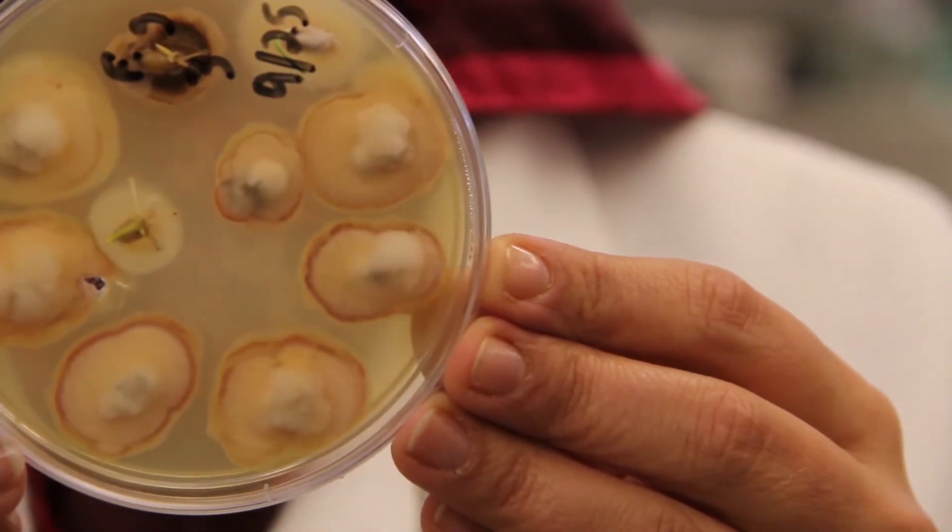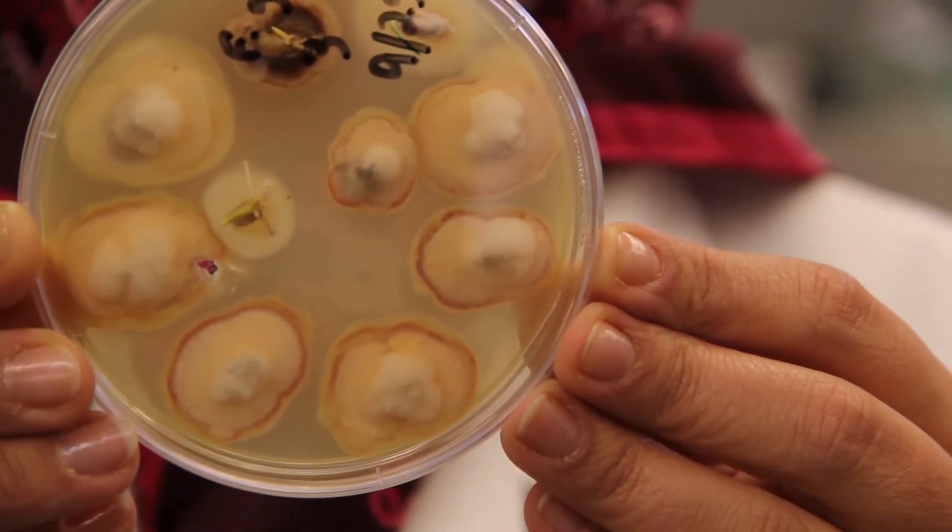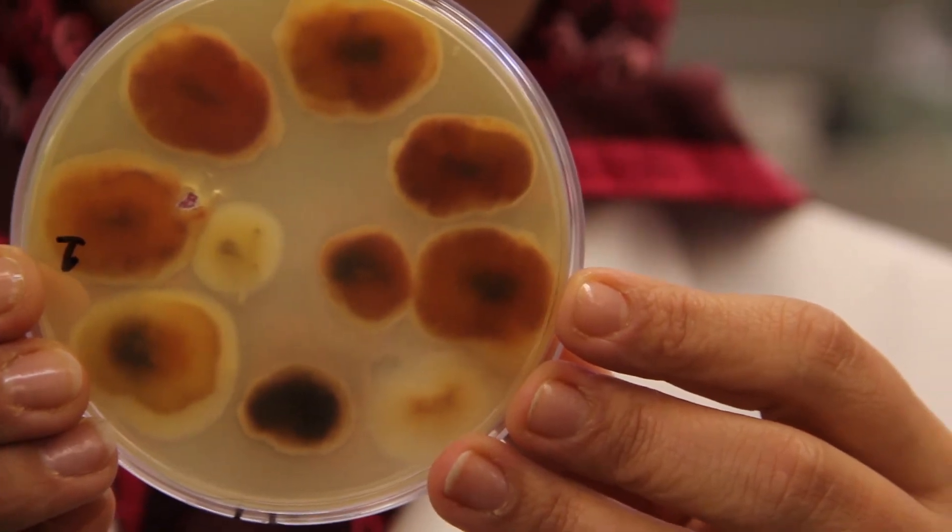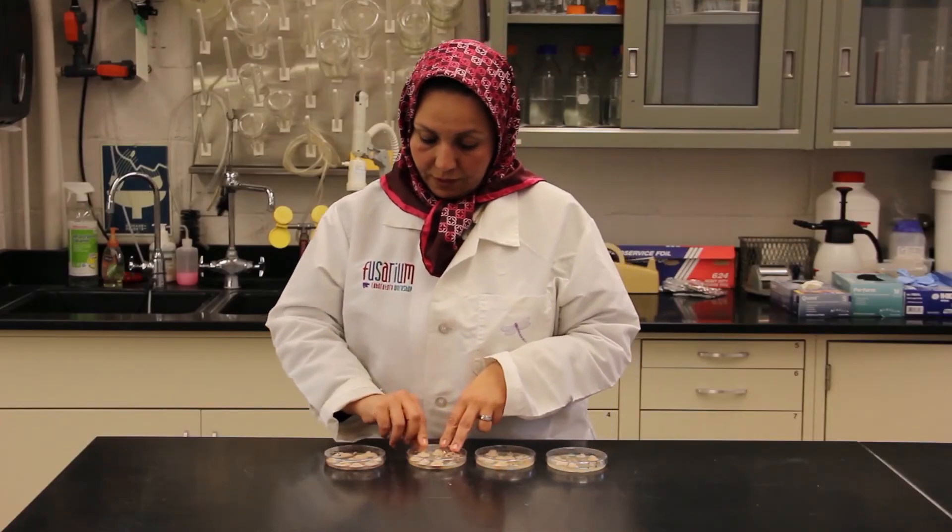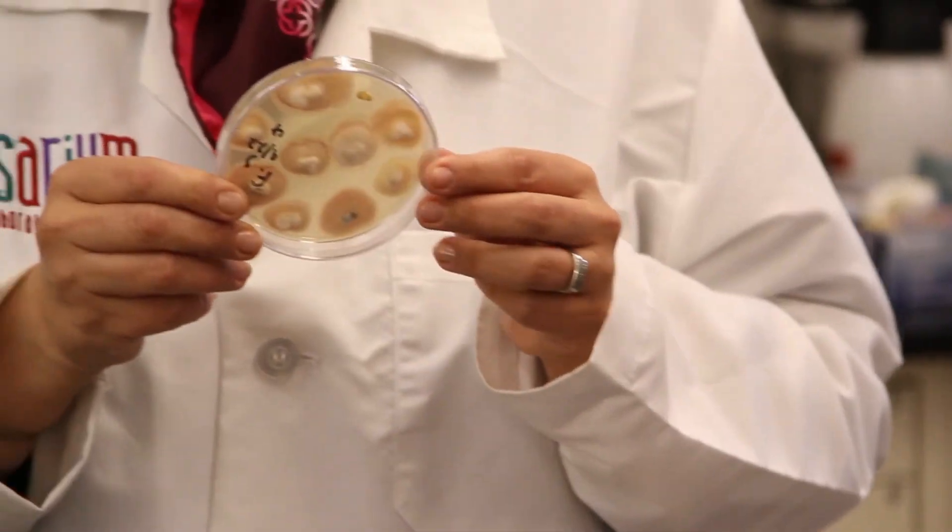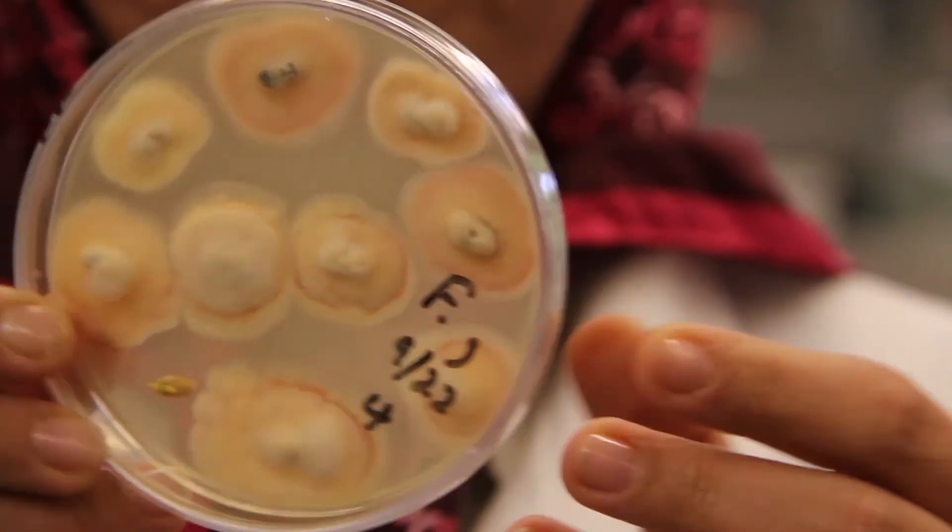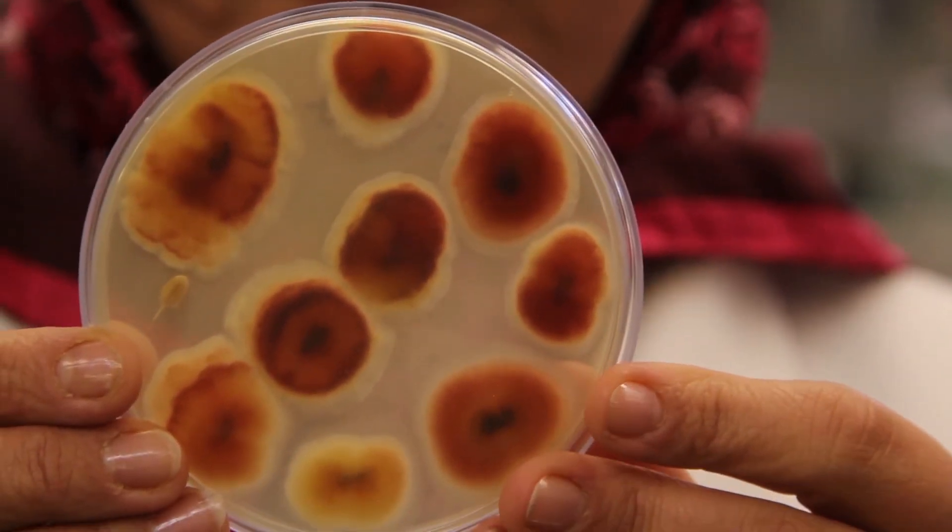And this is the plate after 12 days of plating. So the colors are changing. And this is the plate after 15 days.